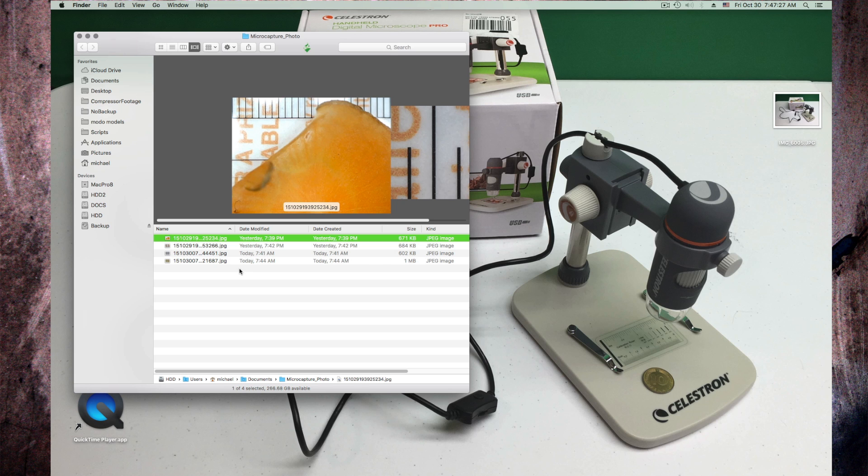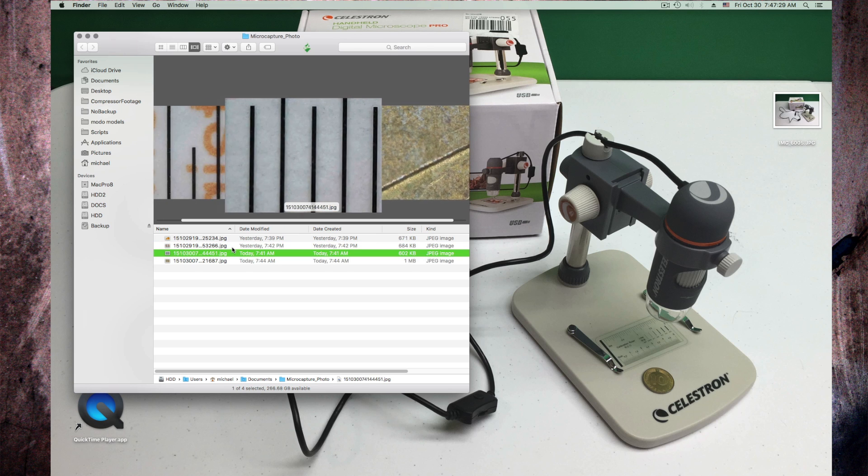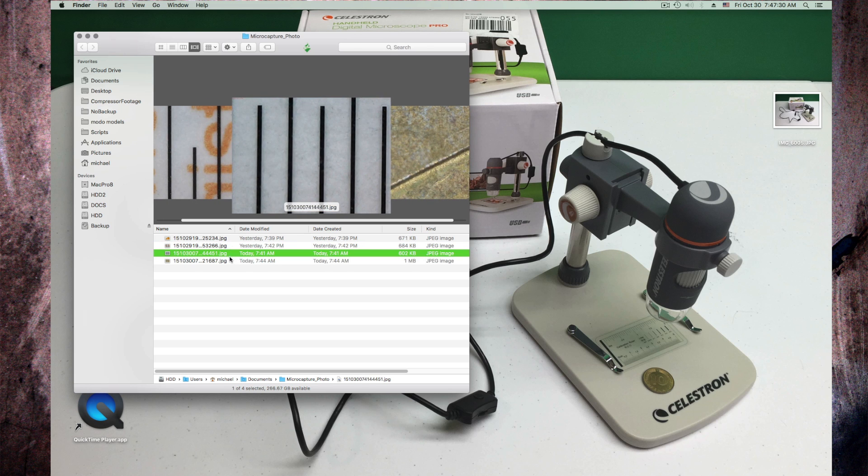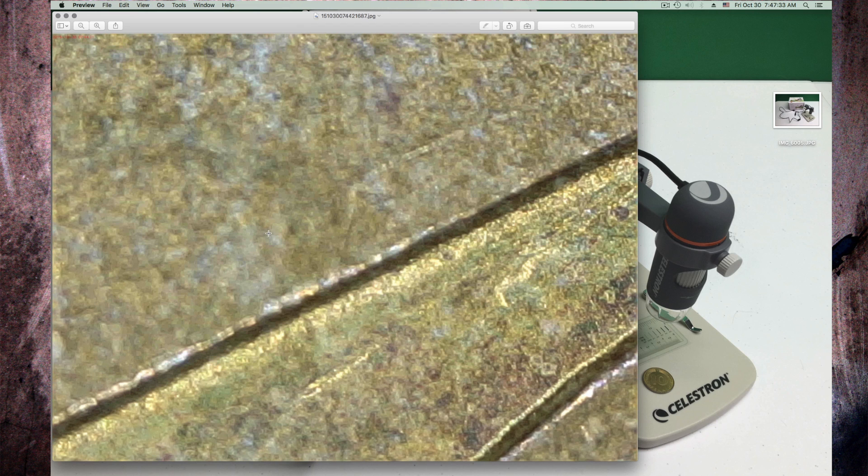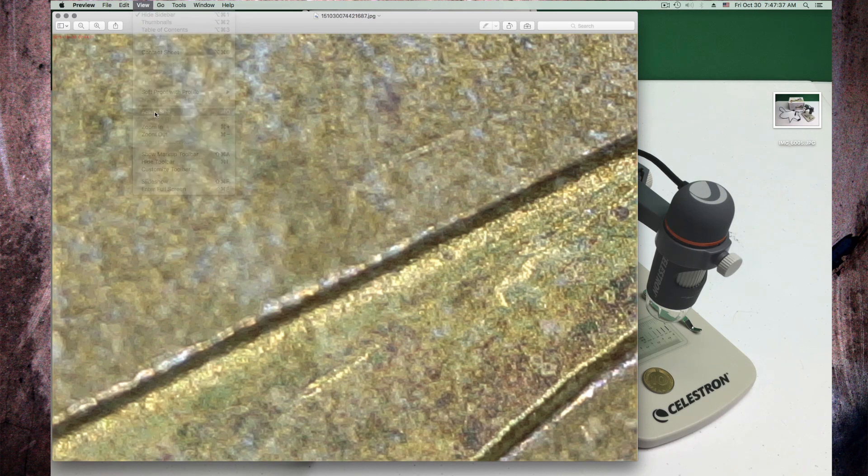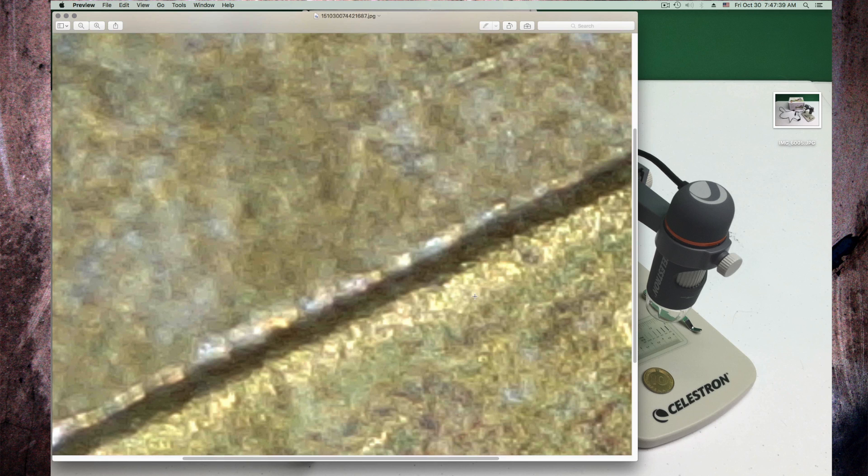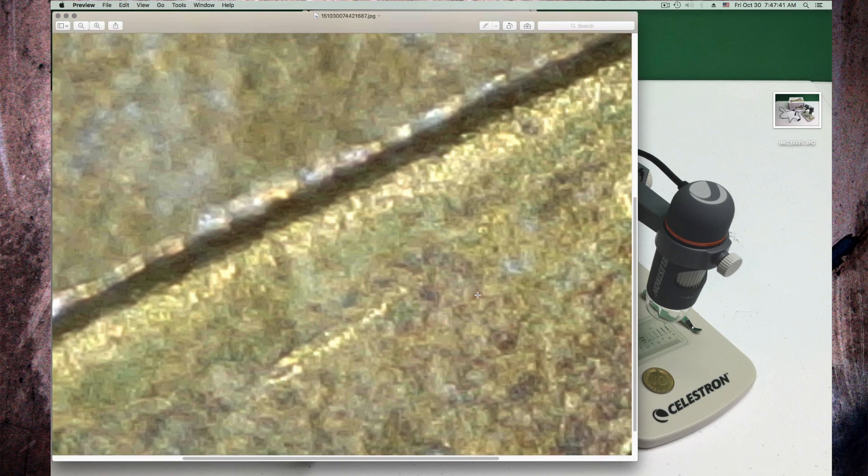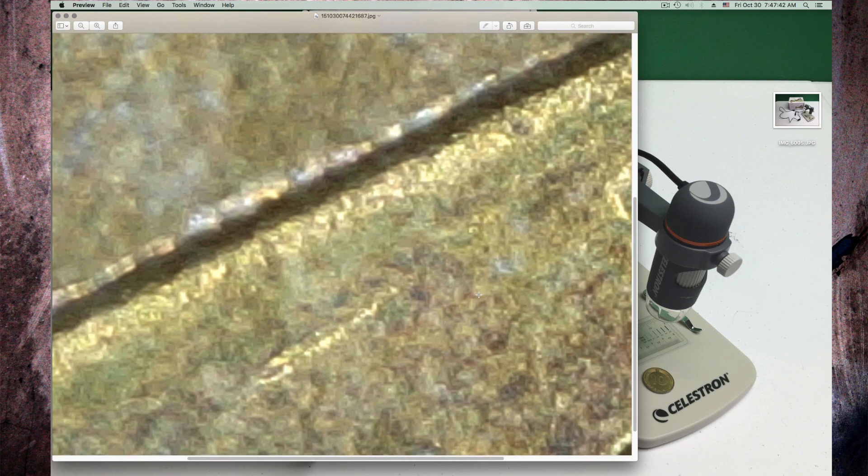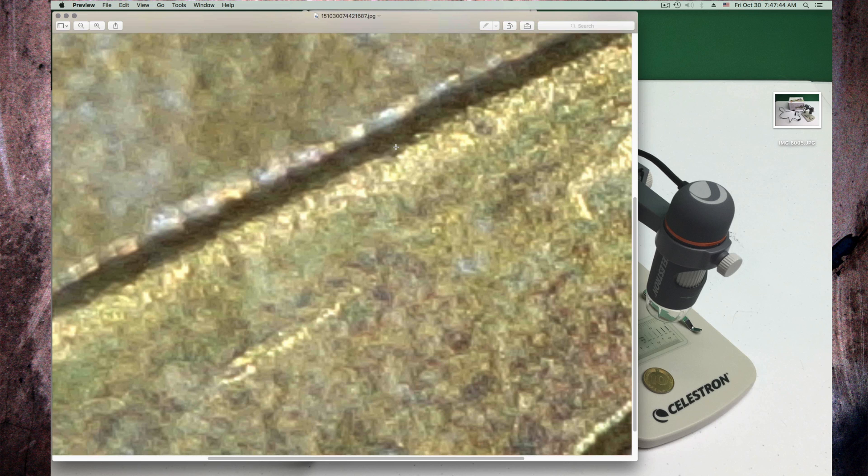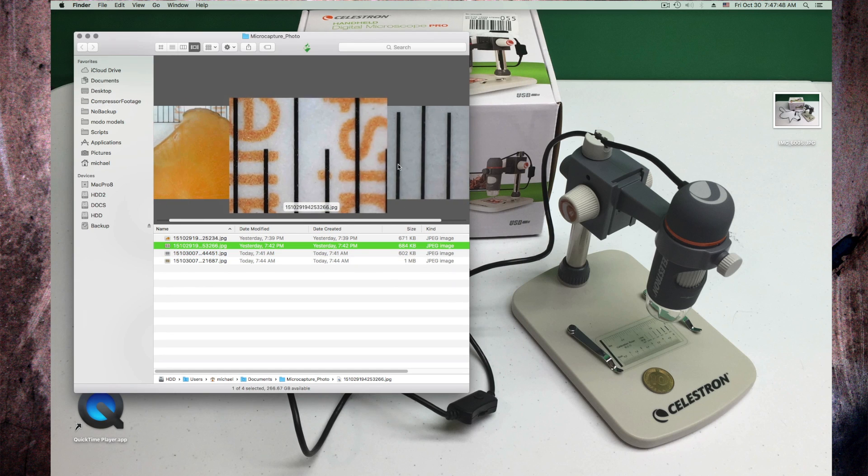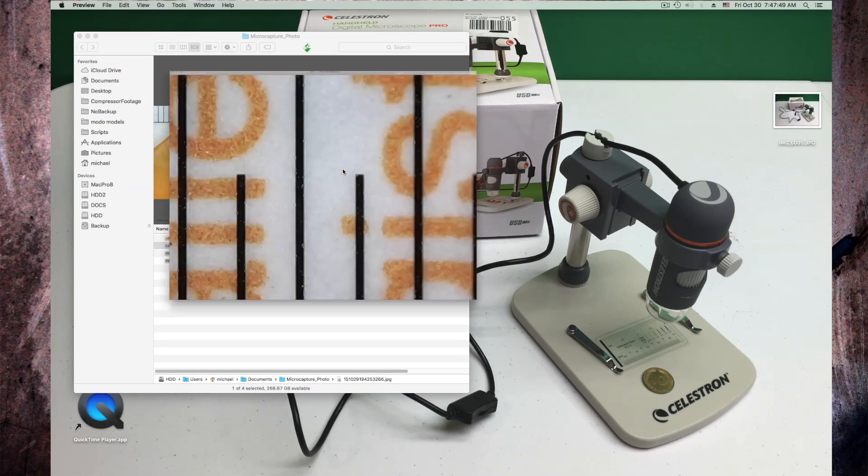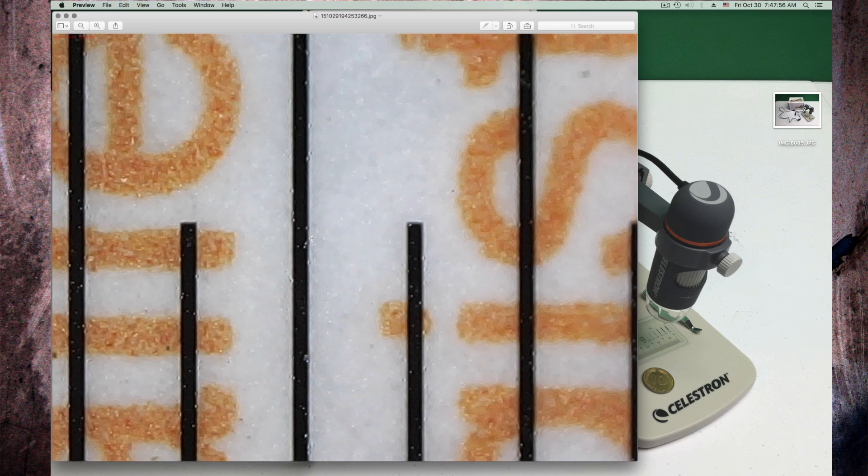In the photo folder I have my photos. This is the photo it took. View actual size. That would be the resolution here. It's not super great as you can see. So there is some fake going on, I bet. And this is another one. The white dots here are on the plastic, so this is like some air on the plastic I guess, the plastic of this calibration ruler.